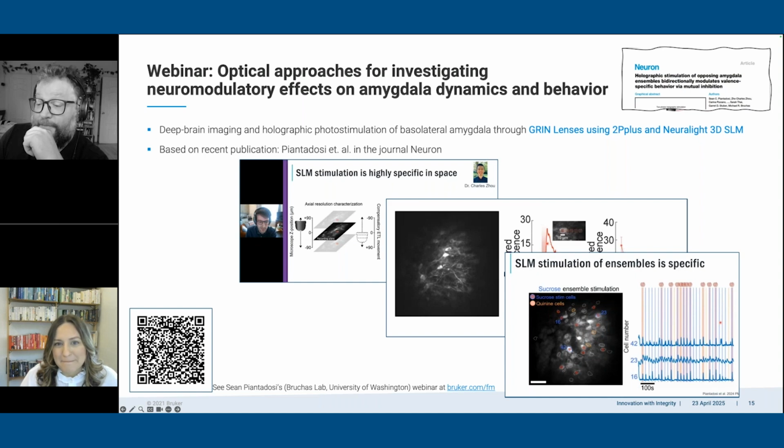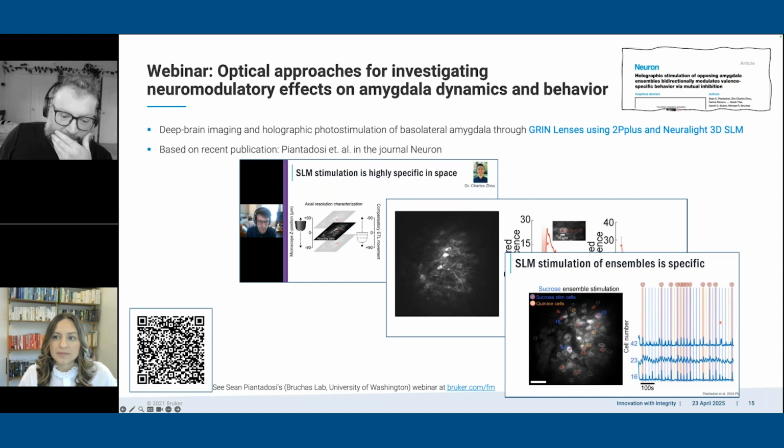Wow, I've never been asked that before. I am not familiar with how two-photon light would work with super resolution. Honestly, maybe this is something I should ask some of the super res team, but as far as I know, super res microscopy is not really great at tissue penetration per se. It's limited in how deep you can actually image with those. So if you want to go full super res, I'm not really sure what the solution is there. That's definitely beyond my area of expertise.